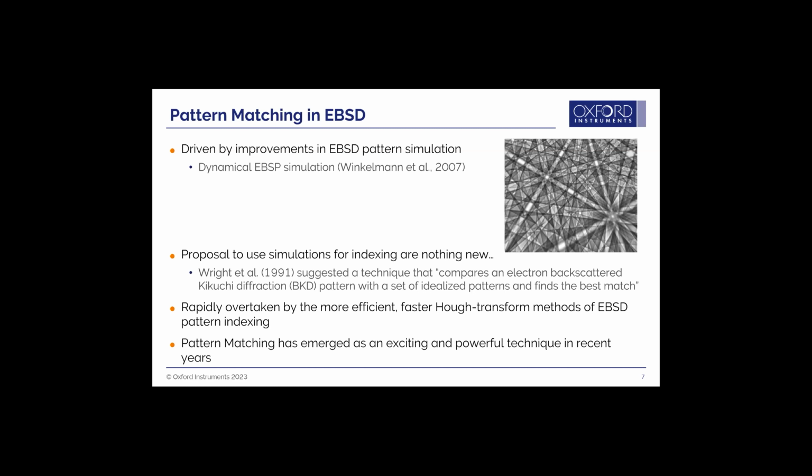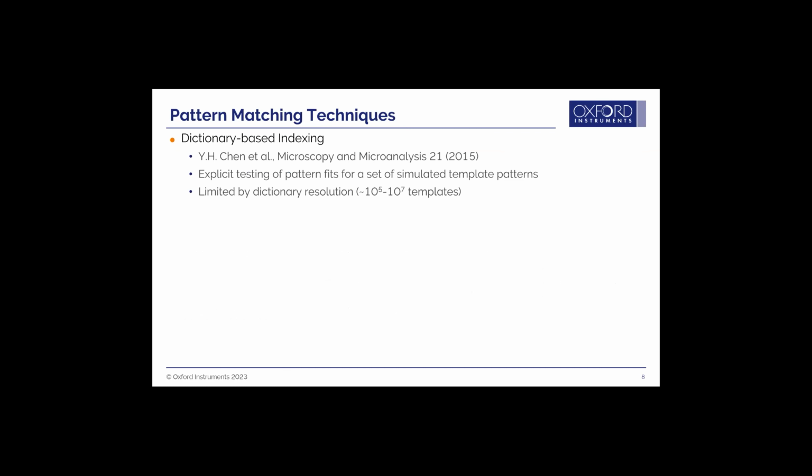Recently, pattern matching has become the emerging, exciting technique. It's because technology is catching up. The simulations are better, the computers are better, so you can actually do this in a manageable time frame. So, going into the history of this here.